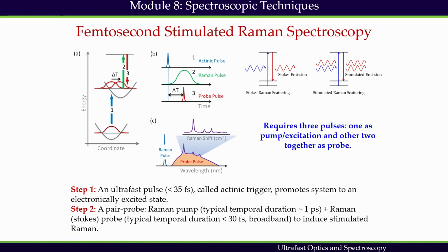So, this Raman pulse and probe pulse are kept at 0 delay. These two pulses drive Raman transition, stimulated Stokes emission, which is shown here.